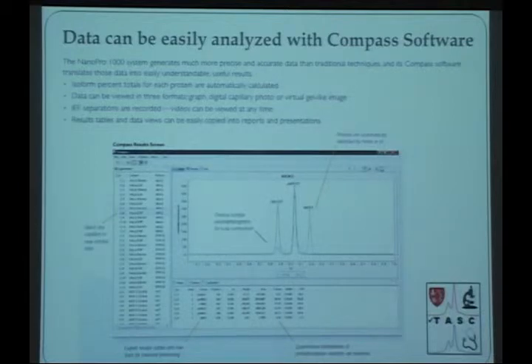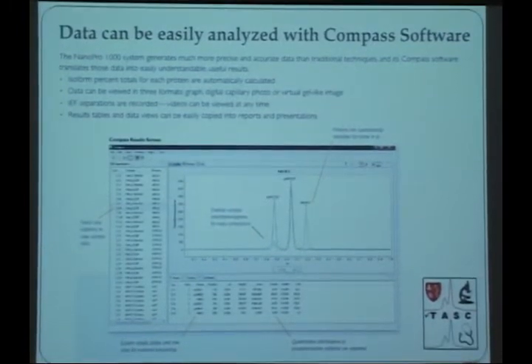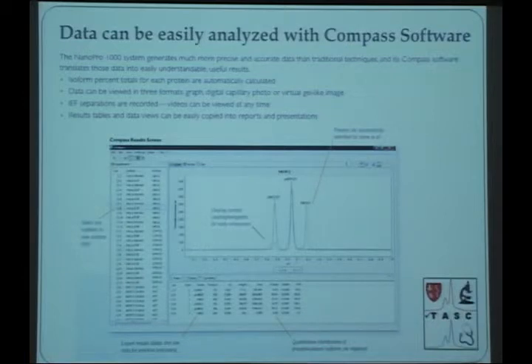But essentially, the main thing you want to do here is calculate the area under the peak, normalize it against the loading control, and then you will get very specific, very numeric, quantifiable data, which cannot be done with a Western blot, even if you get your bands and then try to quantitate it with VersaDoc or whatever other method that you're using. You just can't quantify it because of all the transfers you have done, and there are just too many variations.